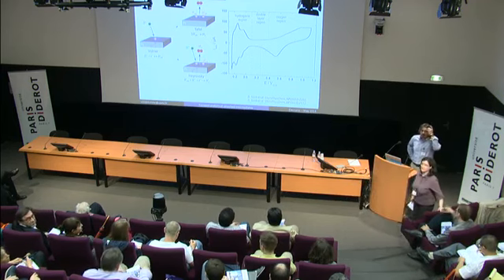Thank you for a good talk. Could you please comment on the complex collection efficiency as a function of the distance between the two electrodes? In particular, is there some optimal distance where the first term in your equation would be negligible? No, you have to remain in the diffusion layer of your substrate. You have to bring your tip into the diffusion layer of your substrate in order to detect something. But you can perform experiments from a few micrometers up to 50 or 100 micrometers. You just have to calibrate your experiment at the same distance as the experiment you are interested in.